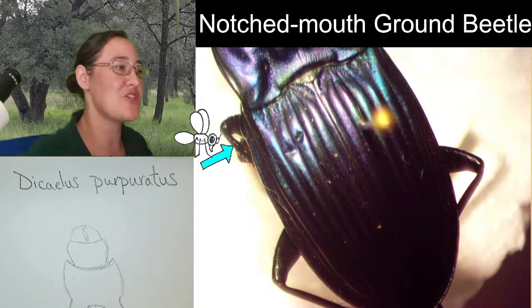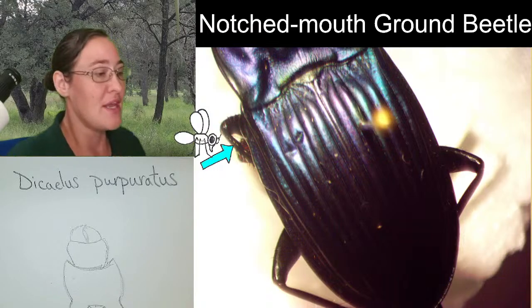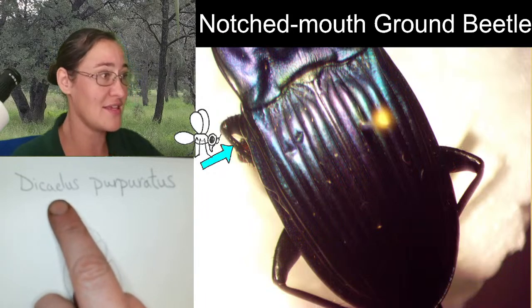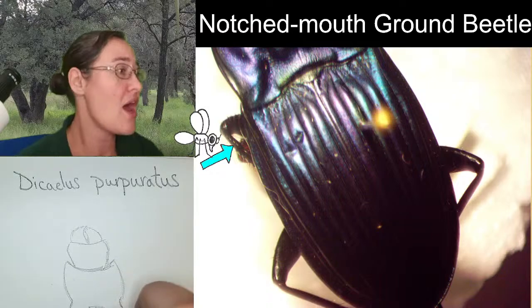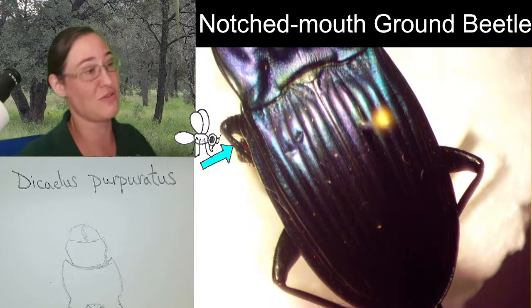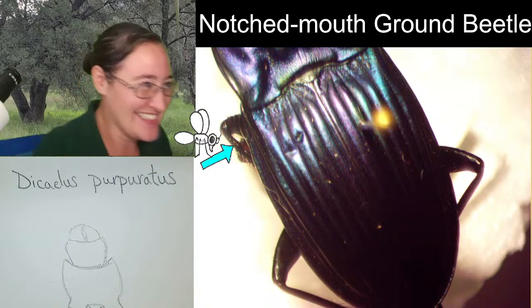The notched mouth ground beetles, that common name is actually assigned to the entire genus Dicaelus. So there's a handful of different species that have that common name. But at least it's a genus level ID rather than just saying it's a ground beetle. You can say it's a notched mouth ground beetle.